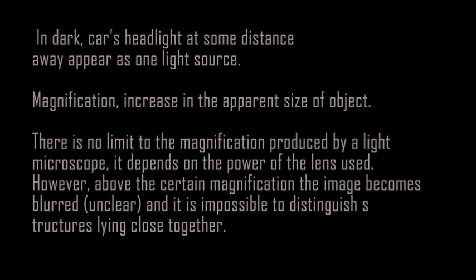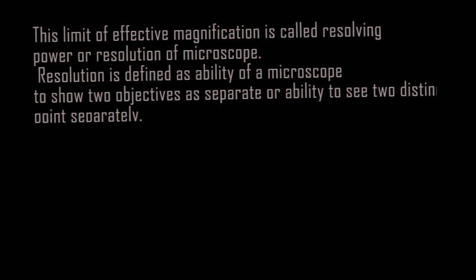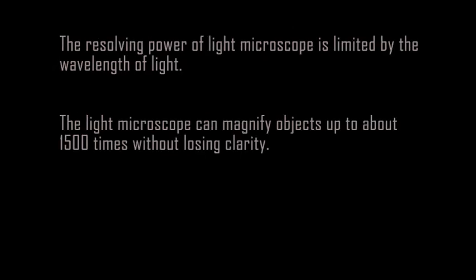So, what is resolution? Resolution is ability to see two distinct or separate points or objects. Notice, the resolving power of light microscope is limited by the wavelength of light.